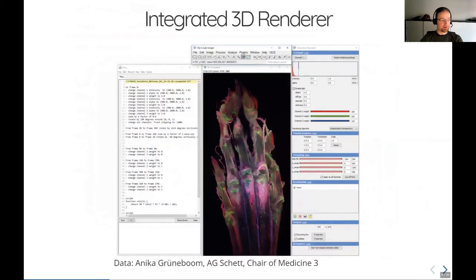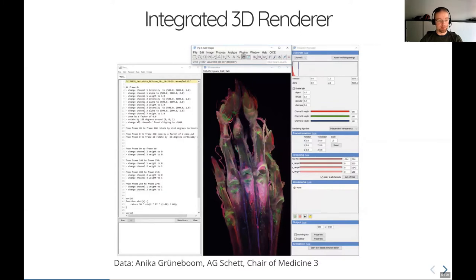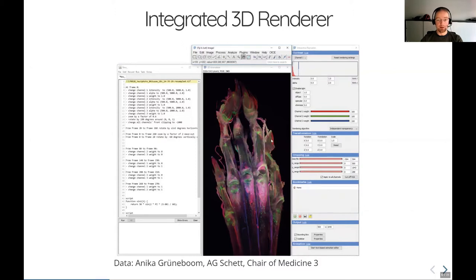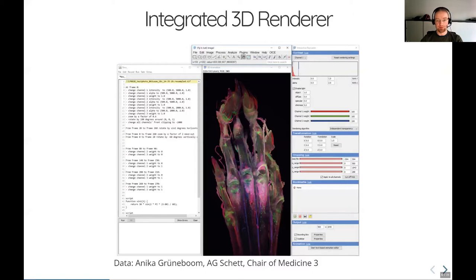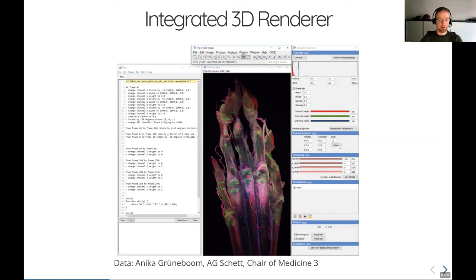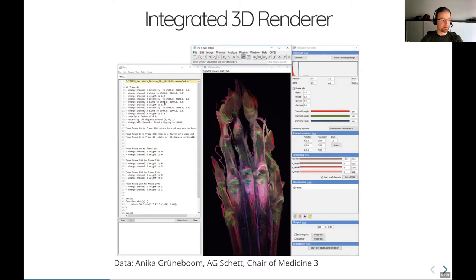So this is how a screenshot of 3D script, this is what it looks like. You see it's divided mainly into three windows. In the middle part here, we have an interactive 3D preview so you can interact with it with your mouse, you can rotate, zoom and so on. On the right hand side is a control window for adjusting the rendering parameters. On the left hand side, you see the animation editor, the editor where we would compose this animation script.